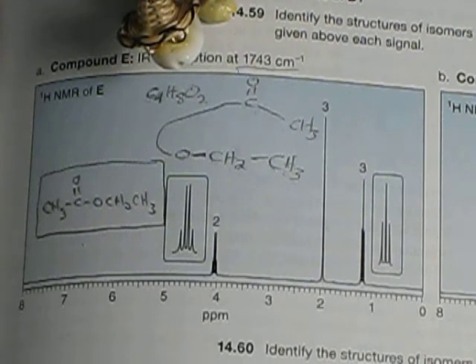Little disclaimer, this molecule is ethyl acetate. It's actually a liquid for you purists out there, but you get the idea. I found a liquid on the balance. And there's a structure. NMR gives you the structure of the molecule. From what's this unknown powder? What's this unknown liquid? I don't know. Run the NMR and the IR, and now you know what it is.